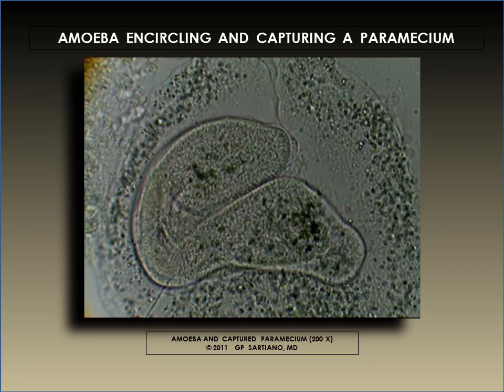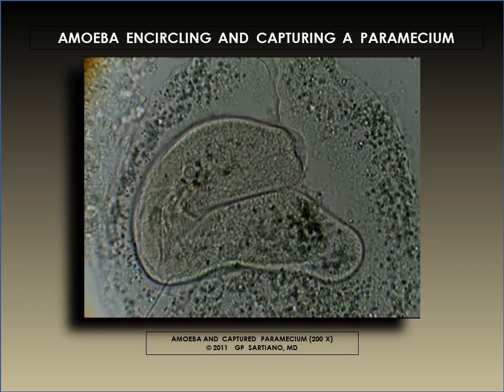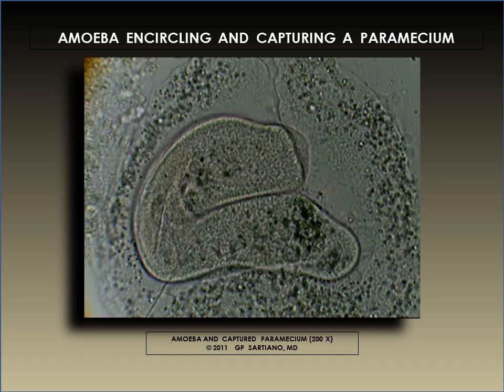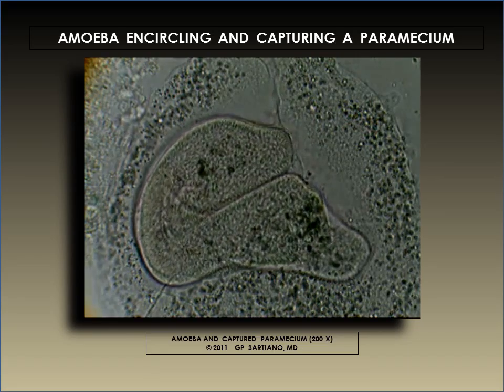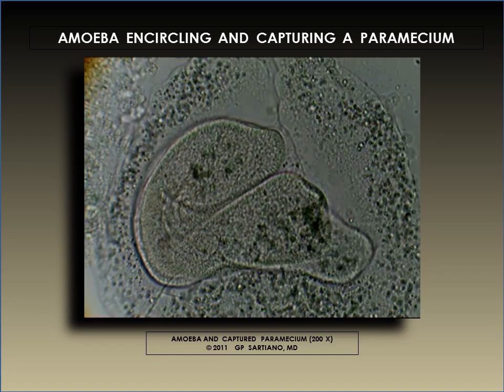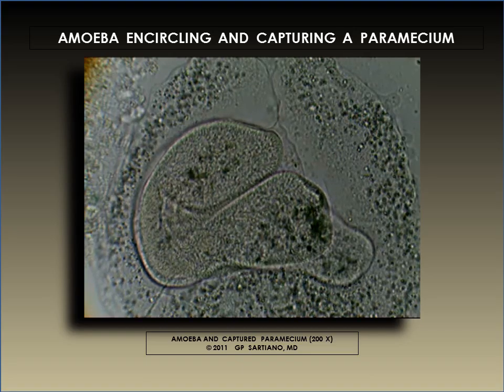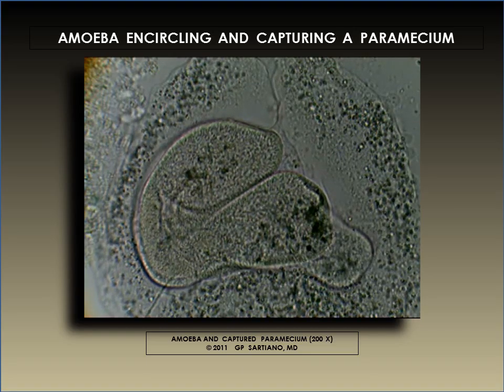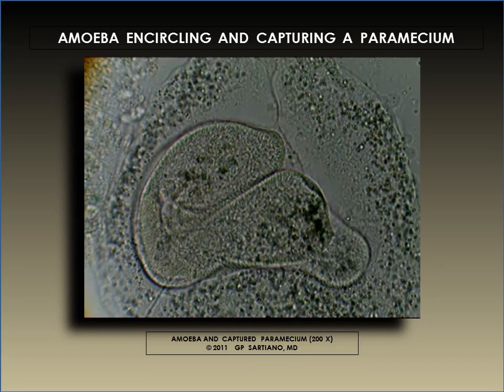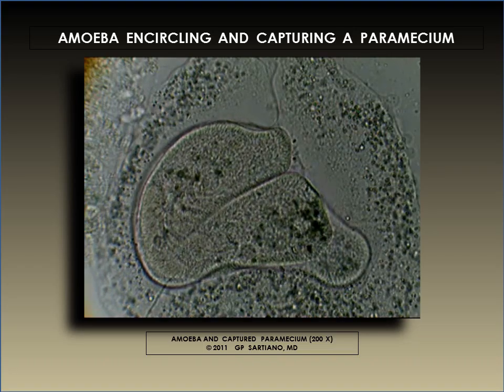The struggle continues, but the paramecium shows diminishing activity and seems to have developed an exhausted state. The movements of the paramecium are now sluggish and few, and the feeble vibrations of its cytopharyngeal cilia resemble those of a dying organism.